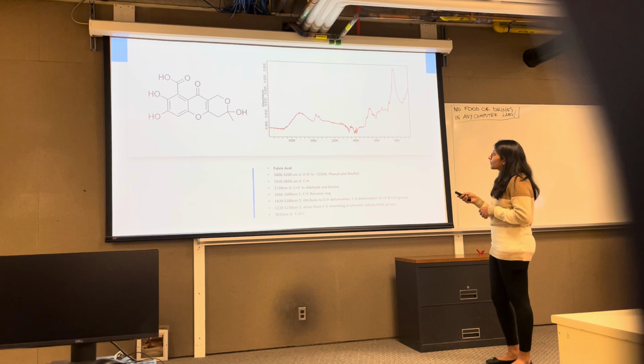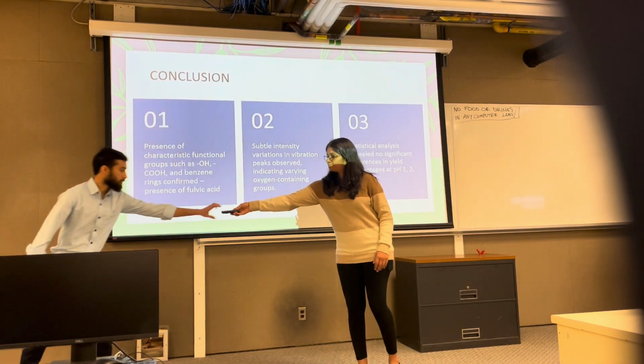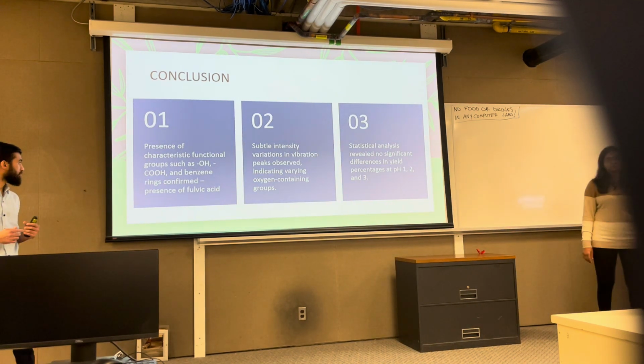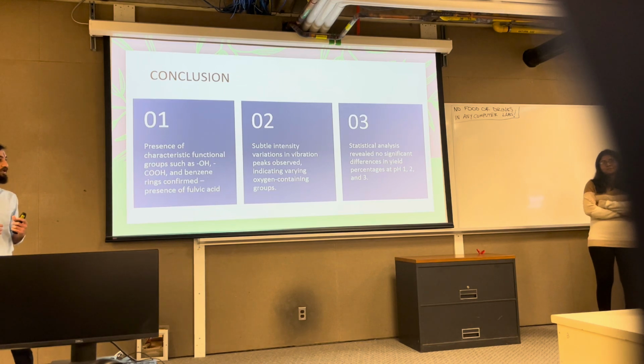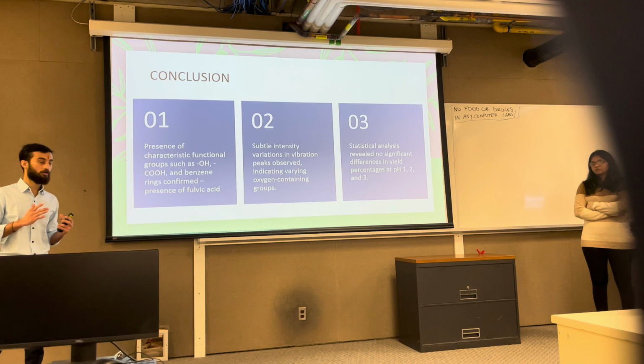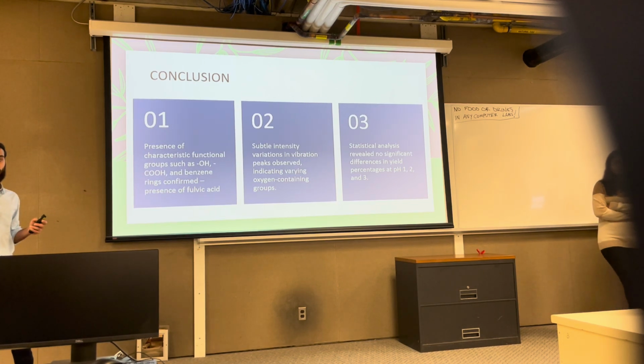And I would like to call Neville for further. Hello guys, we got group samples. As mentioned, first we got a Shilajit blend, which is already a processed one, so we didn't get any fulvic acid content. Then Margaret purchased a new Shilajit, which is a pure Shilajit. So we got fulvic acid content, but only a trace amount.